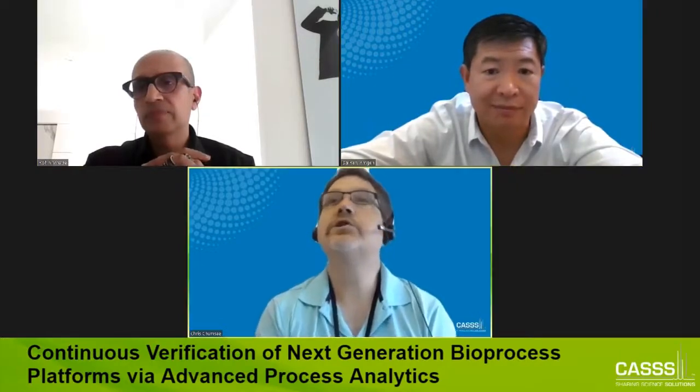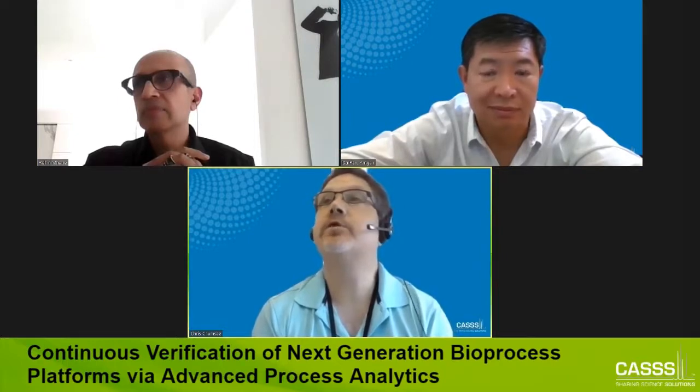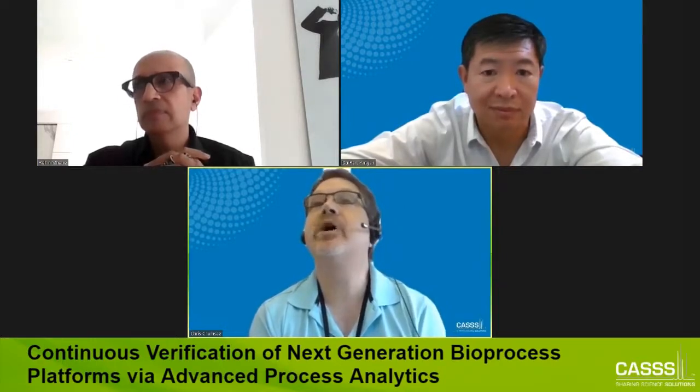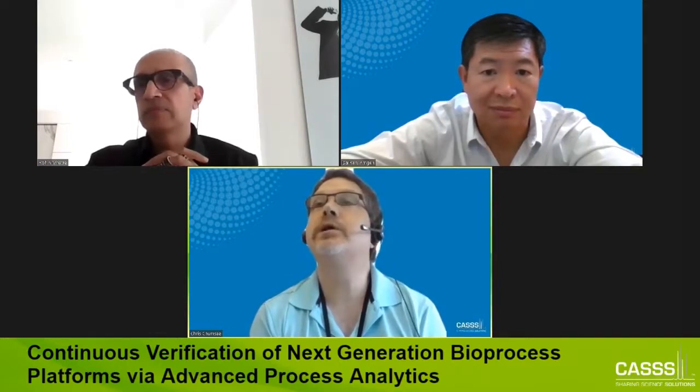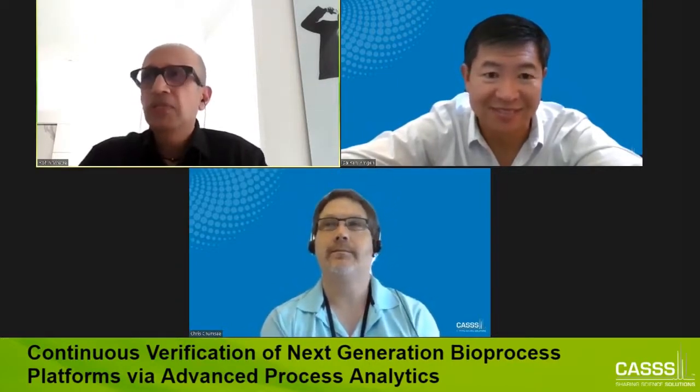Great, thanks. Our next question is, good predictive models usually need a broad range of data for training, including bad process situations. Controlling the processes to be mostly good, how do you generate the bad situations to improve models? Yeah, that's a very, very good question, actually. That's what I alluded to earlier. In some cases, it's really using the right kind of training sets to generate this data.